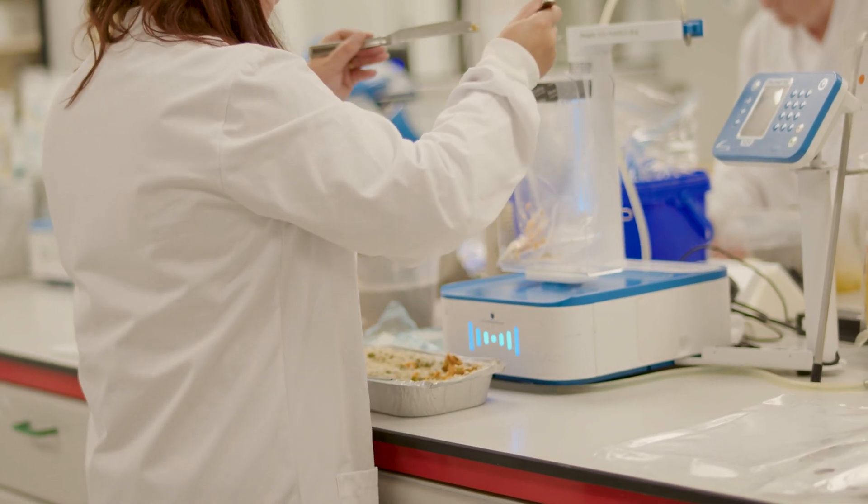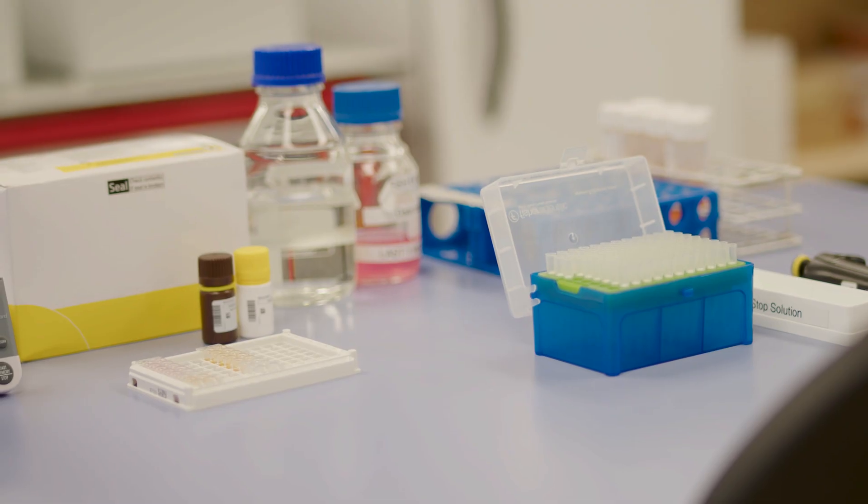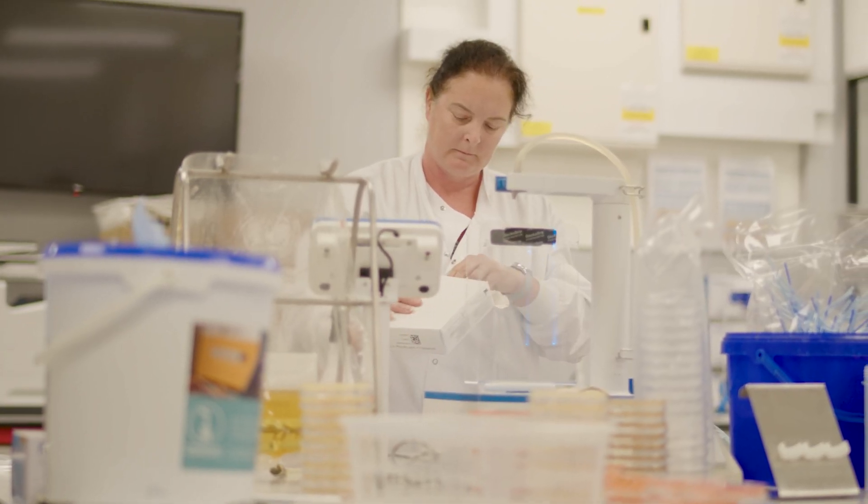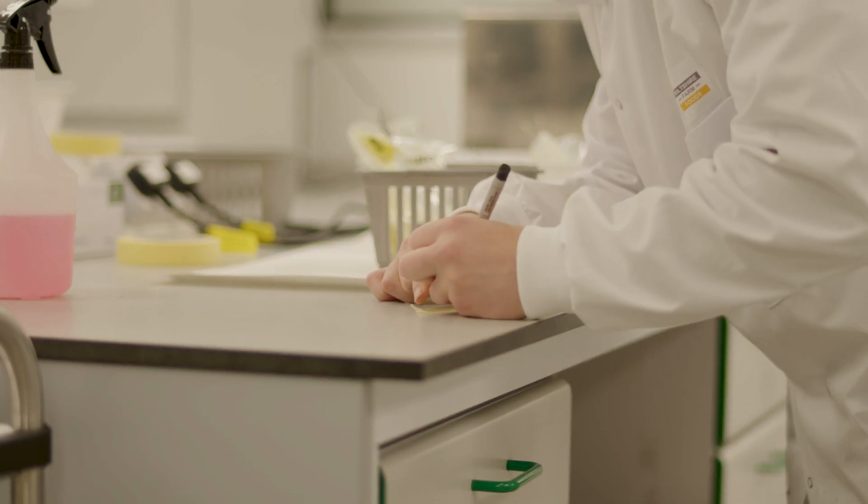Every test we do for allergen freedom is included within that count, and we also do additional monitoring exercises. While we look after the safety of our food, we also look after the environment in which we're making that food.